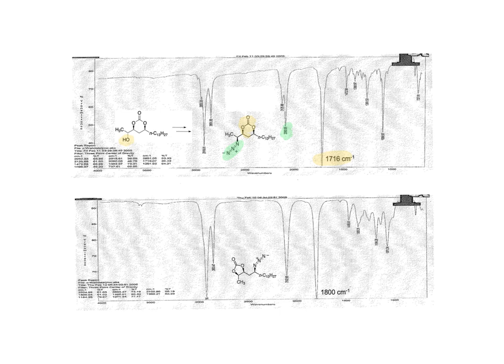We then set out to make the diastereomer by the same route. But instead of forming the 6-membered ring carbonate, there was a rearrangement to give the 5-membered ring carbonate, which gave a carbonyl stretch at 1800 wave numbers. This experience, for me, exemplifies the value and the importance of infrared spectroscopy for compound characterization.